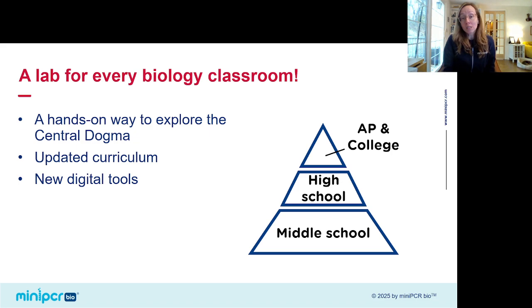If you're new to the Central Dogma Lab and you're not already familiar with it, know that this is a lab for every biology classroom. It's a great way to support hands-on instruction around this essential biology topic.